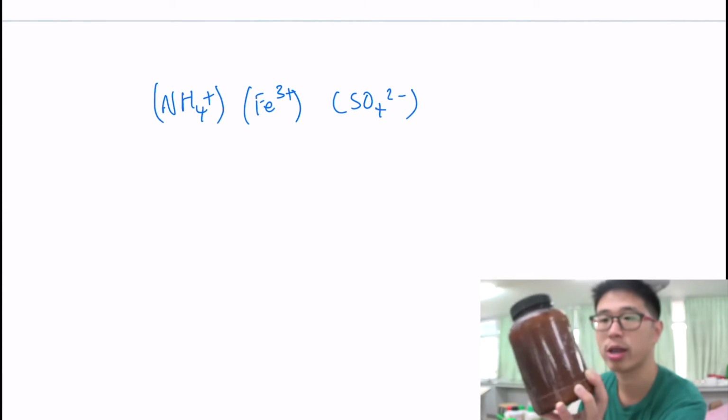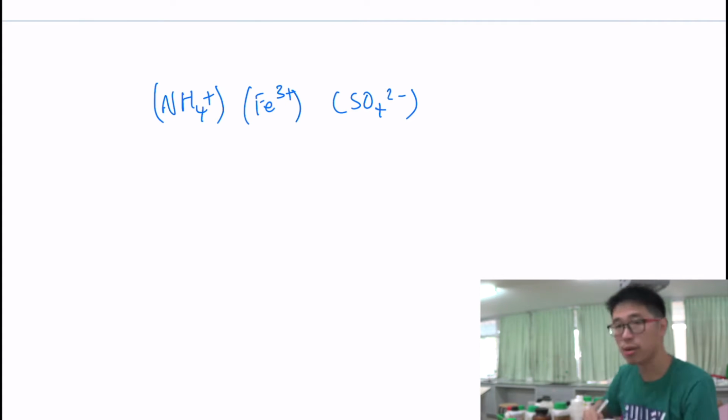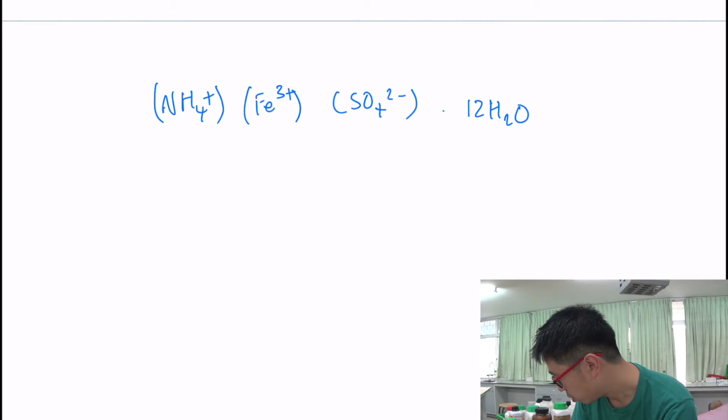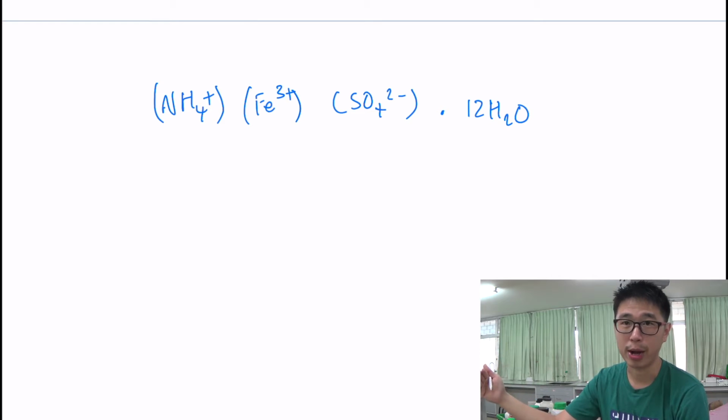So the molecular weight, the molecular mass, the Mr is around 482.18. So you can do this as your own exercise based on what I show you in the previous example using ammonium iron 2 sulfate. The water of crystallization again here means that they could ask you to heat this solid and take observations as qualitative analysis, and you will get colorless liquid forming on the upper part of the tube.